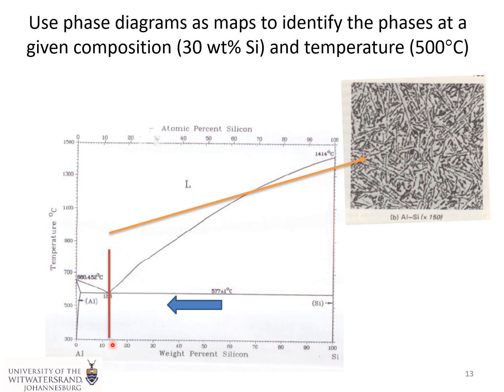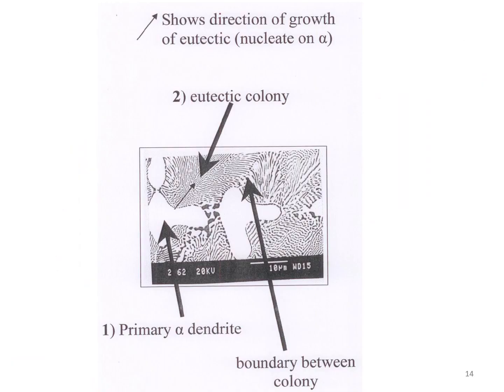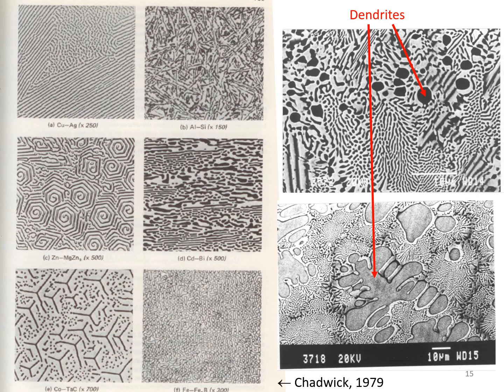here we've got another eutectic, aluminium silicon, and that's what it looks like. Okay, so you've got silicon needles in a nearly pure aluminium matrix. And what happens with eutectics, when you've got the dendrites, they tend to grow on the dendrites and grow away from it, because the dendrites would form first, the primary alpha dendrite. Now we've got the eutectic going, and it's going in that direction. There's another one going in this direction, and where they join, you quite often get a mismatch.